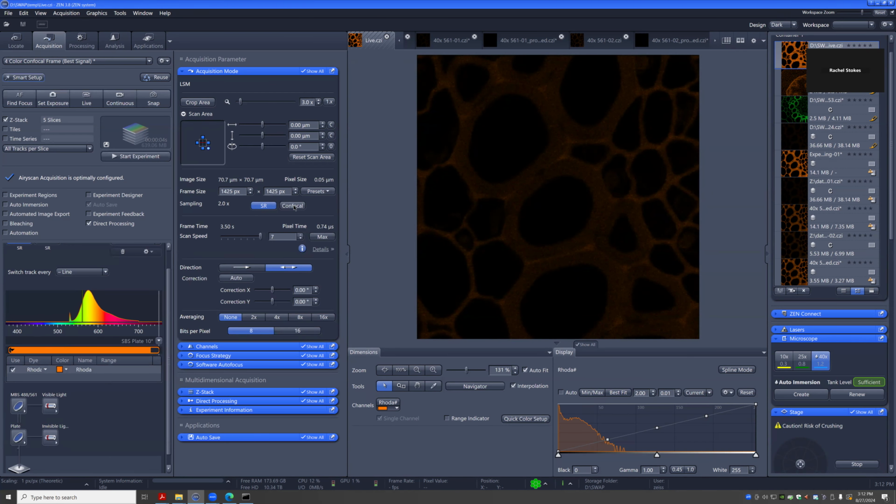Now we just have these two options here. This is where I was talking about if you undersample a lot, you can do that in this mode, right? I can say 512 by 512. You can't really do that in that speed mode because it's tied to those specific sampling speeds. Here, it doesn't really matter.